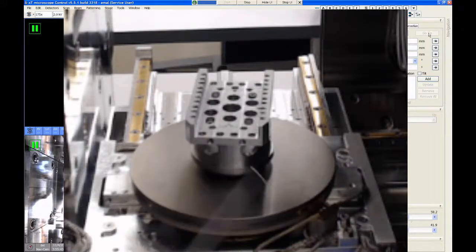Unfortunately, all of these parts are very expensive to replace. So if you strip out the screw on one of these things, it's probably going to cost us several thousand dollars to replace it from FEI. So just try to be careful as you're working here.